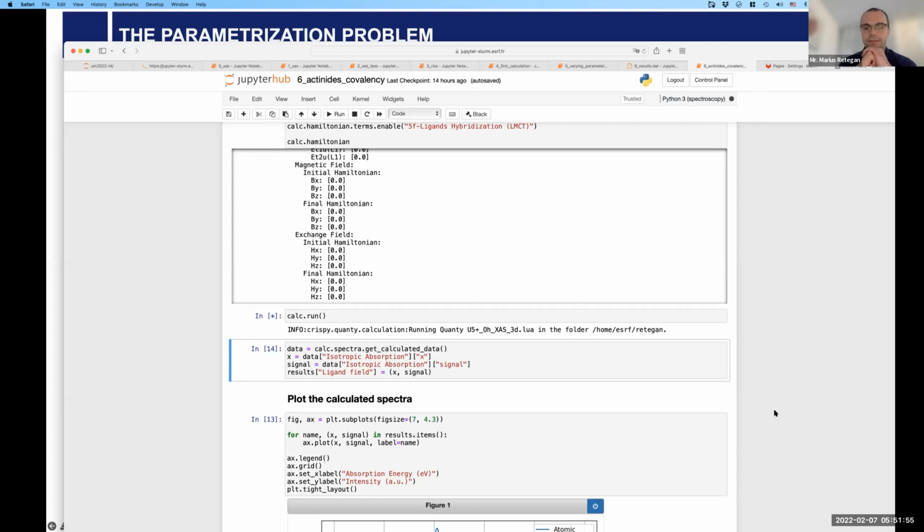For writing an online lab journal, we were usually writing it into a Word file, because you need one lab journal which you can then take together with your data. Handwritten is one option, but because we have many different experimenters over the night and during the day, we usually write a text file, usually in Word, where we say we measure at 10 o'clock in the night this sample, and then we change and put in different gases, and at the moment we just say, well, then we measure file number 712.